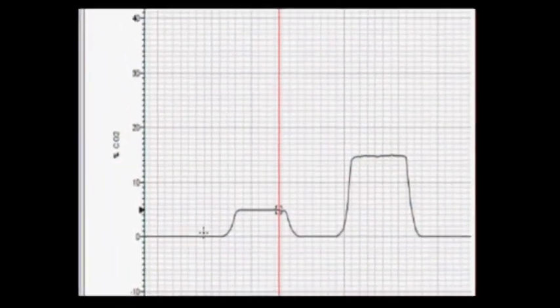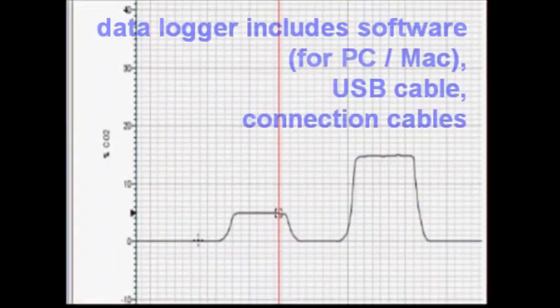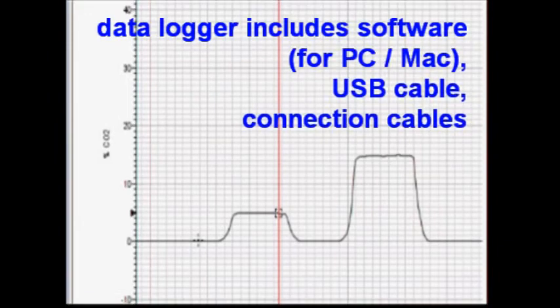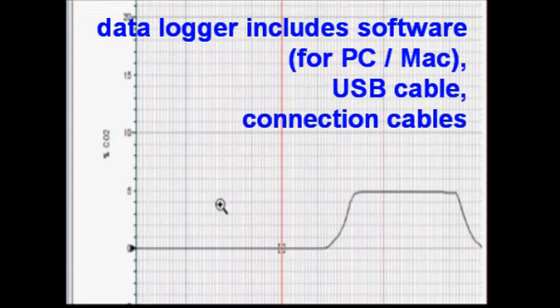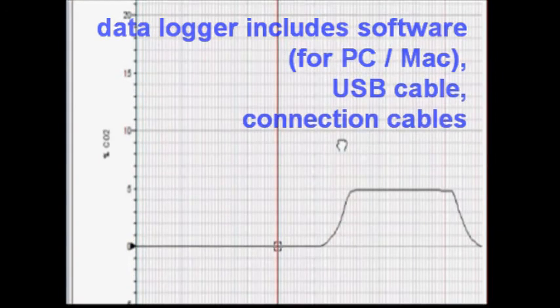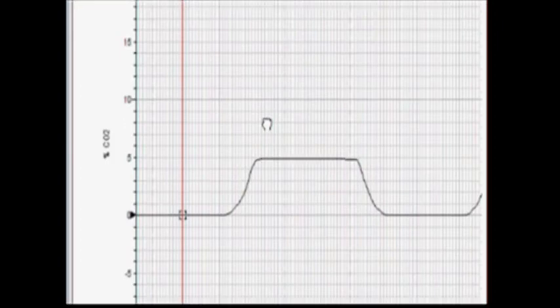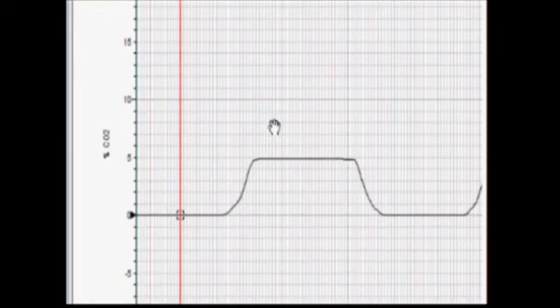This is the software that comes with the data logging package. We've set the data logger to record a measurement every second, although you can set that interval to be as long as 18 hours. It really gives you the power to collect data over long-term experiments.